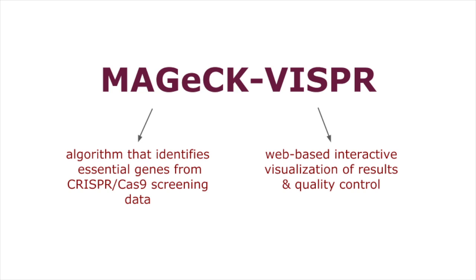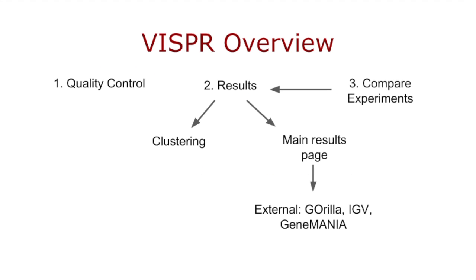Visper is the interactive visualization framework that displays results and quality control data from magic analysis of CRISPR-Cas9 screens. In the previous video, we demonstrated Visper's quality control capabilities. In this video, we'll show you how Visper displays results.